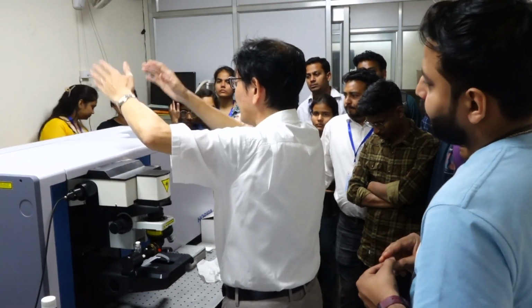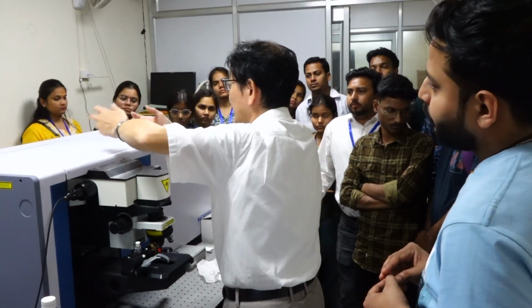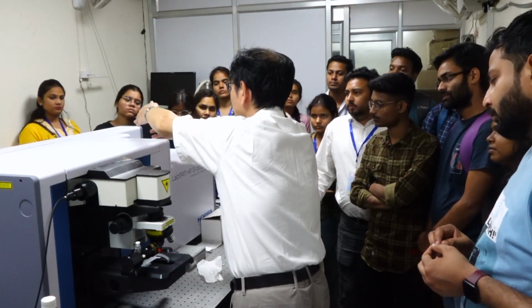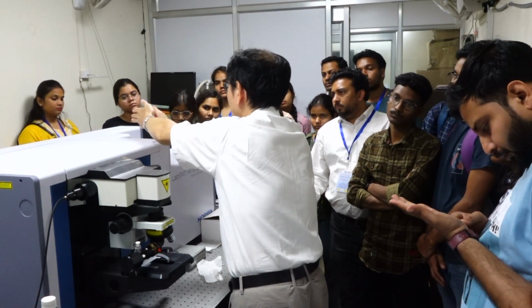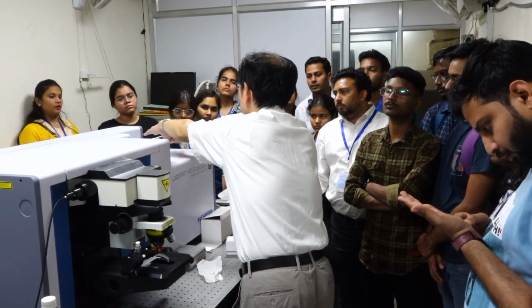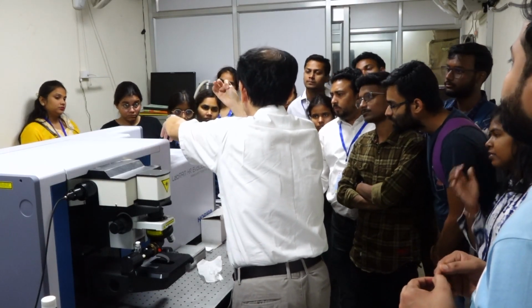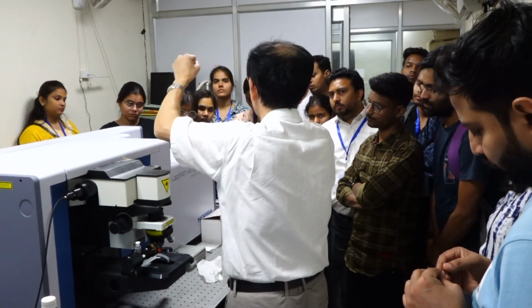But anyway, by separating the Raman signal from the excitation laser beam, the mixed Raman signal is introduced into the monochromator. Then the monochromator includes the grating. Then the grating separates the mixed color into each wavelength. Then the separated wavelength is detected by this CCD detector. CCD is the abbreviation of charge-coupled device that converts photons into electrons.